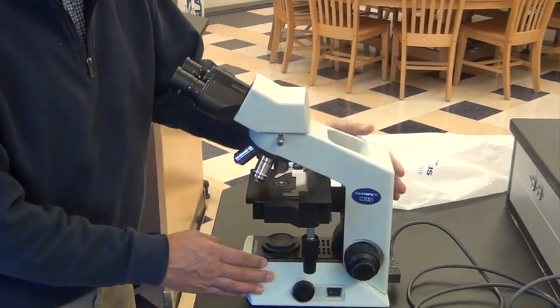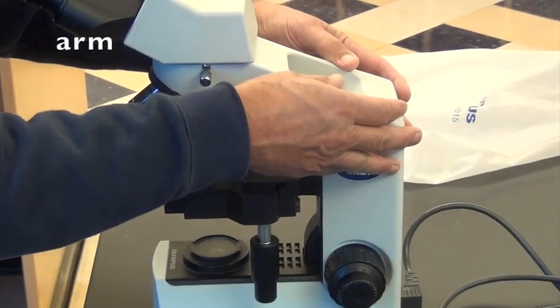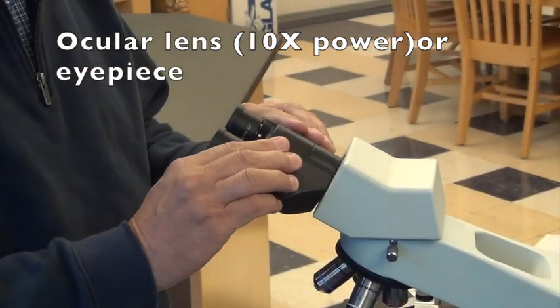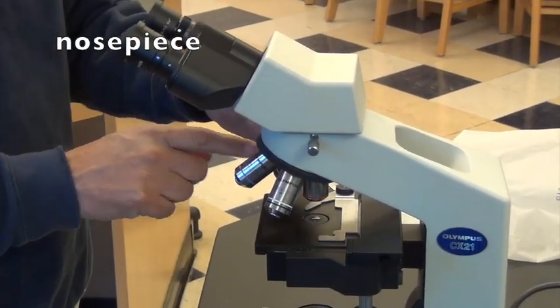On this particular microscope, as all microscopes, you've got a base, then you've got an arm, and up here you've got the oculars or eyepieces — there are two names for them. This is the nosepiece here where the objective lenses are.